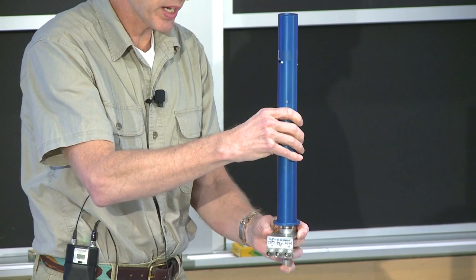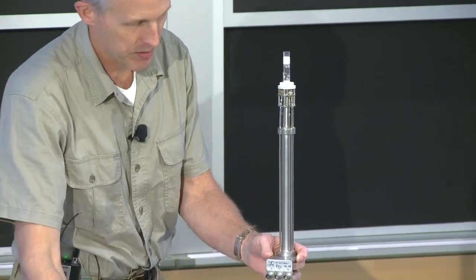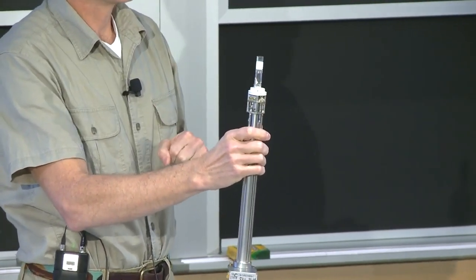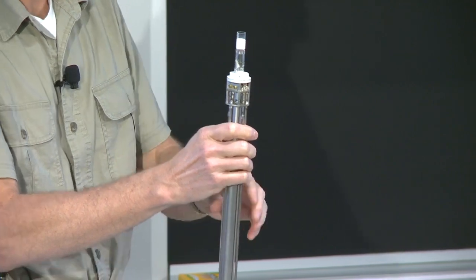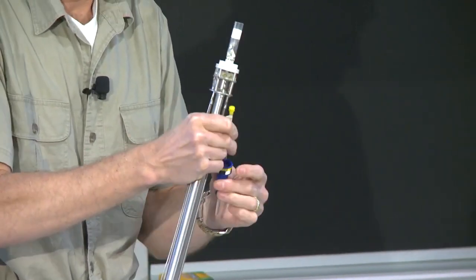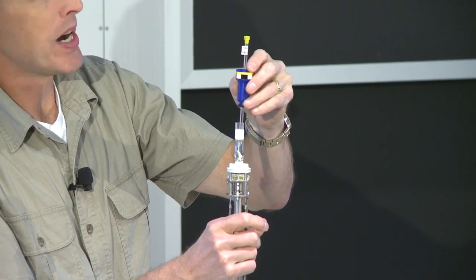And so this one I can take the cover off of, and you can look at this when you come up. Up in the very top of the probe there's a little glass insert, and there's some flat ribbons of wire that are wound around here. And so I've got that pointed out. In fact, I think that's the same probe that I took a picture of. And so your sample will go down, and it will go right into where those coils of wire are.